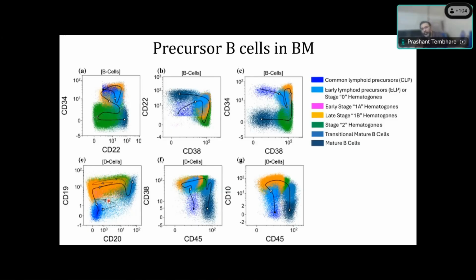If you go to the literature from 3 or 4 years back, you will read that CD20 comes after CD19, but no. CD20 comes before CD19 expression in some of the cells, and then comes CD19. CD20 has very up and down antigen expression.